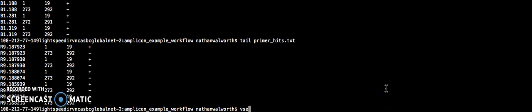So let's go ahead and enter the command. So we have vsearch, there's fastqfilter, all of our sequences from the original step. And then vsearch, when denoting these commands, requires a double dash.